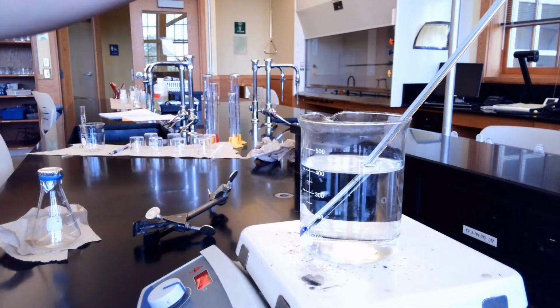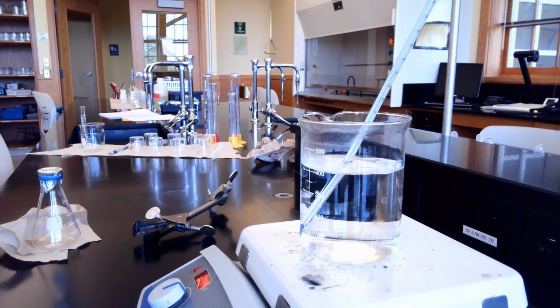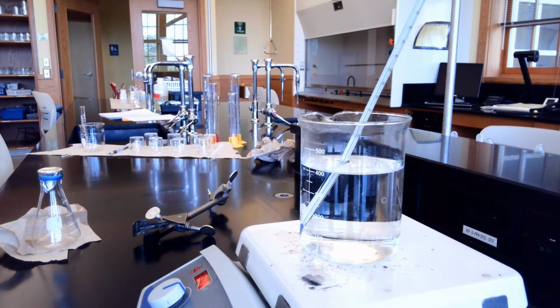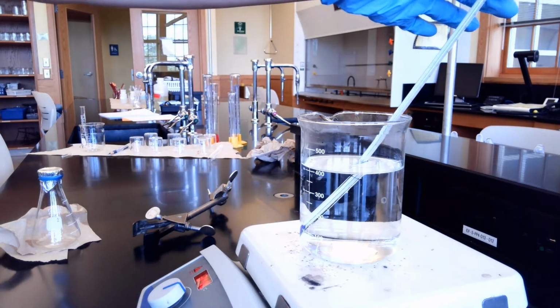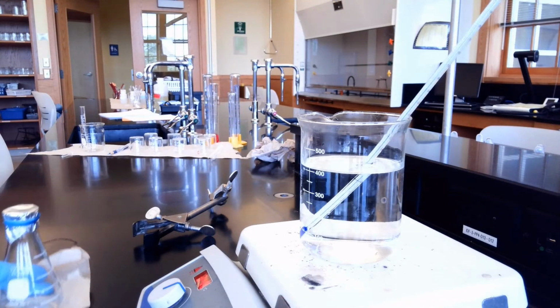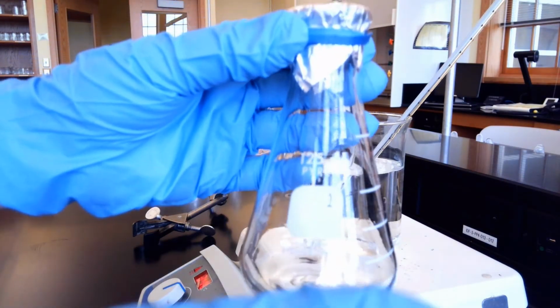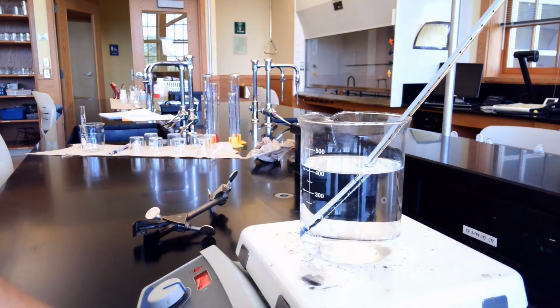And the temperature of the water that it's boiling at is 98 degrees Celsius, okay? So 98 degrees Celsius. Once this cools, what we'll do is we'll take its mass, and then you'll have the mass of the container with the vapor.